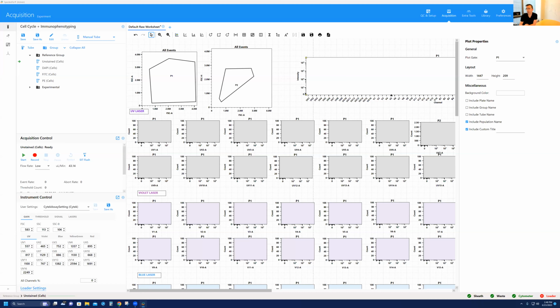Yeah, there's another question. It's also related to fixing. So after fixing, when we add dyes such as an intracellular staining, what can we do to keep the samples from losing signal for 24 to 48 hours? I would say keep them in the fridge and in the dark as much as possible. Yeah, and be careful about the use of tandem dyes too. Probably more than 48 hours, right? More than that, it's very unlikely that you wouldn't lose any signal, right? You wouldn't compromise any of the resolution you already have.